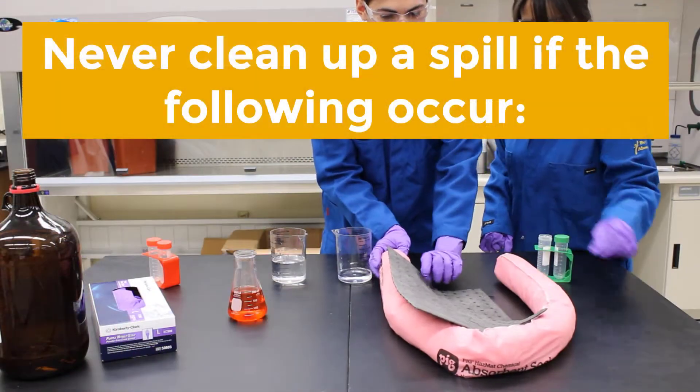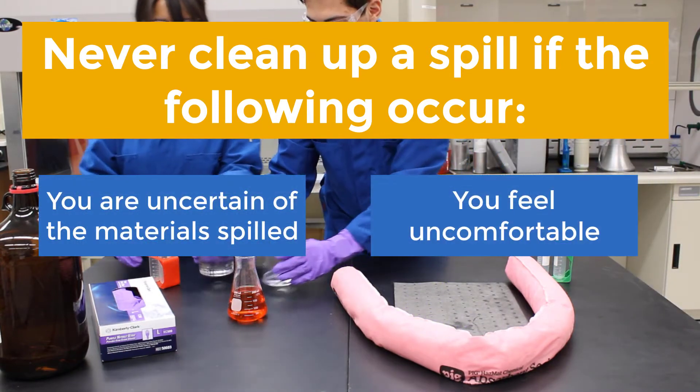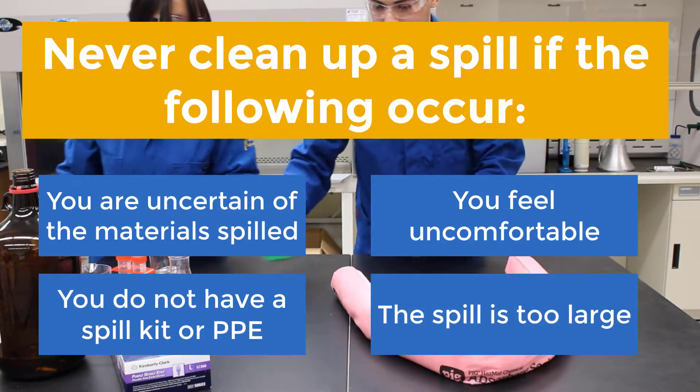You should never attempt to clean up a spill if the following occur: you are uncertain of the materials, you feel uncomfortable cleaning up the spill, you do not have a spill kit or the proper PPE, or the spill is too large for you to clean up.